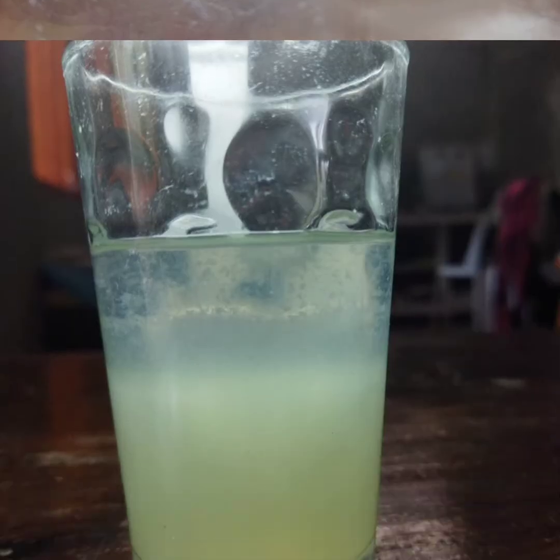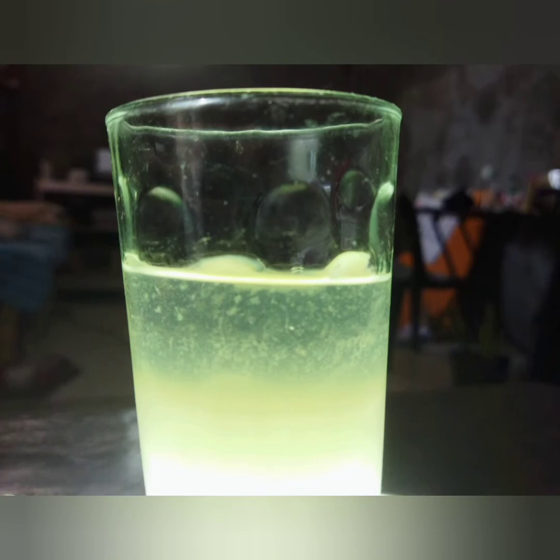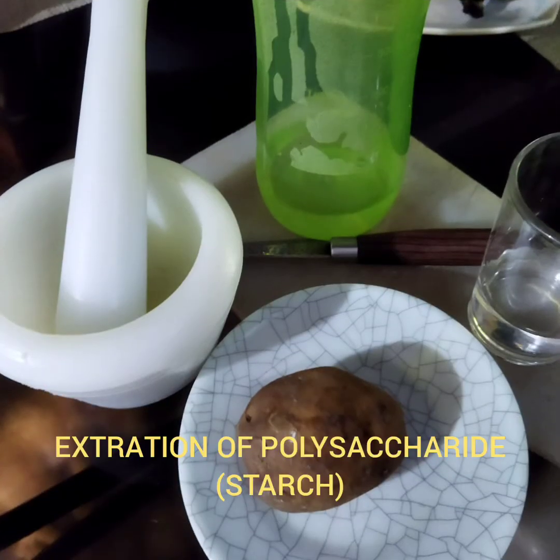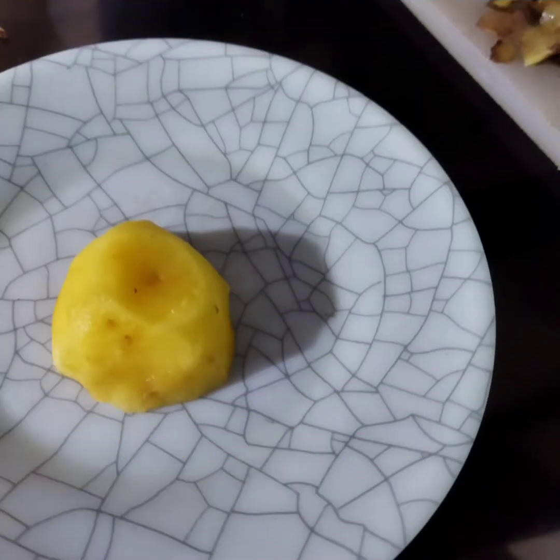First, prepare the materials needed for the experiment. Fill up the plate and cut the potato into small pieces. Continue to grind or smash the potato, then transfer it into a receiving vessel.